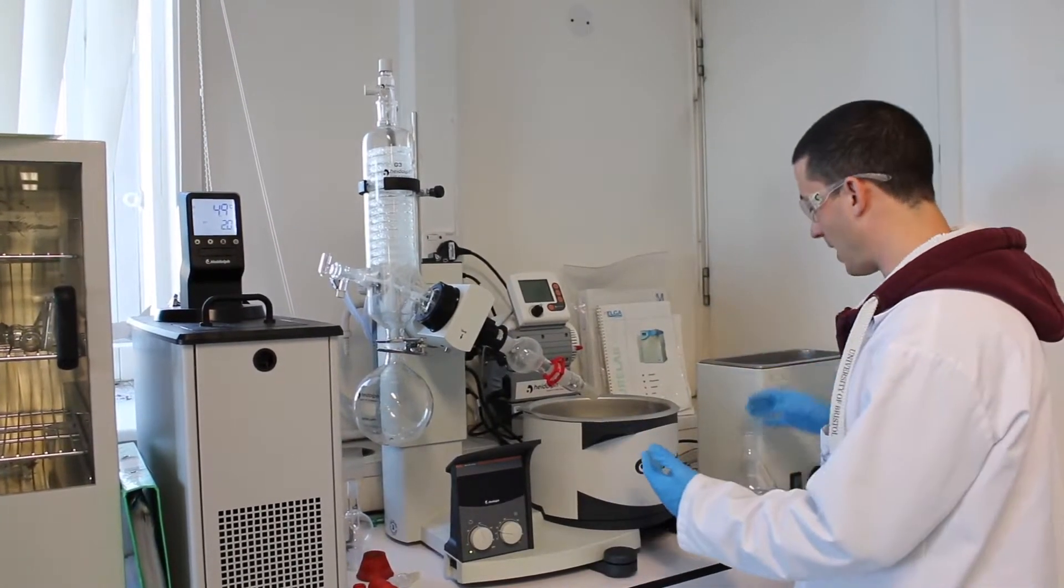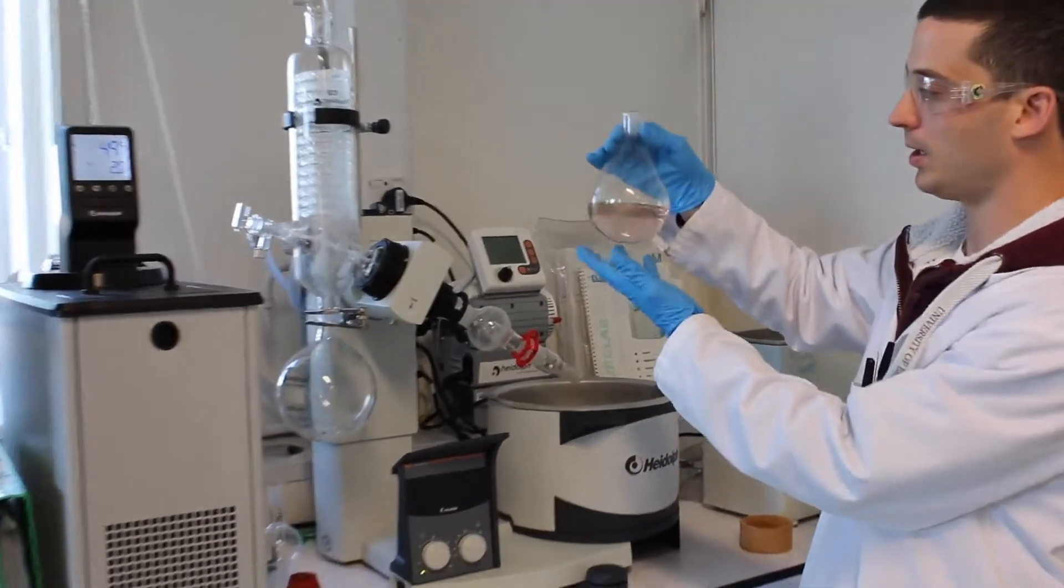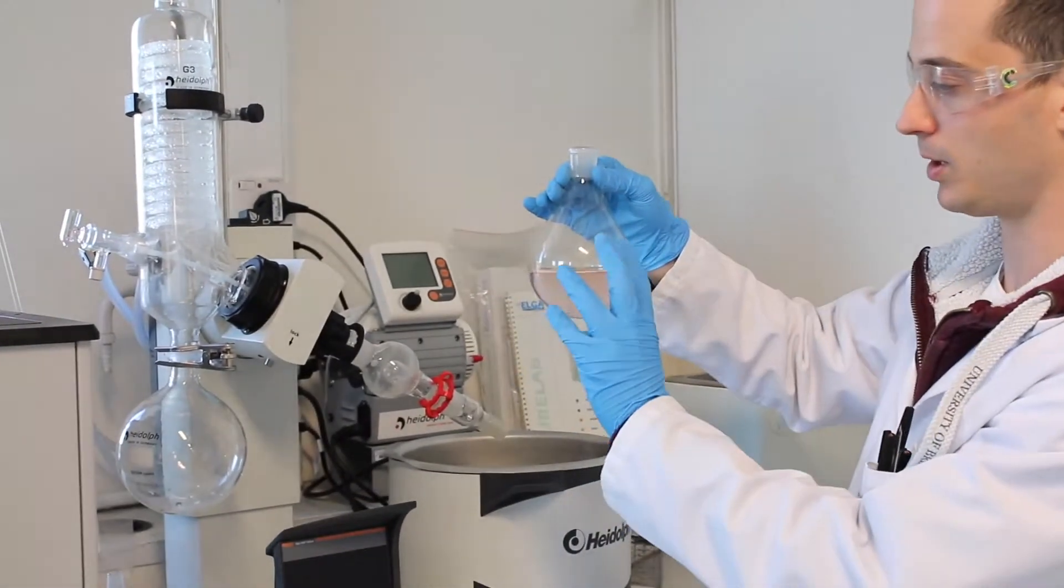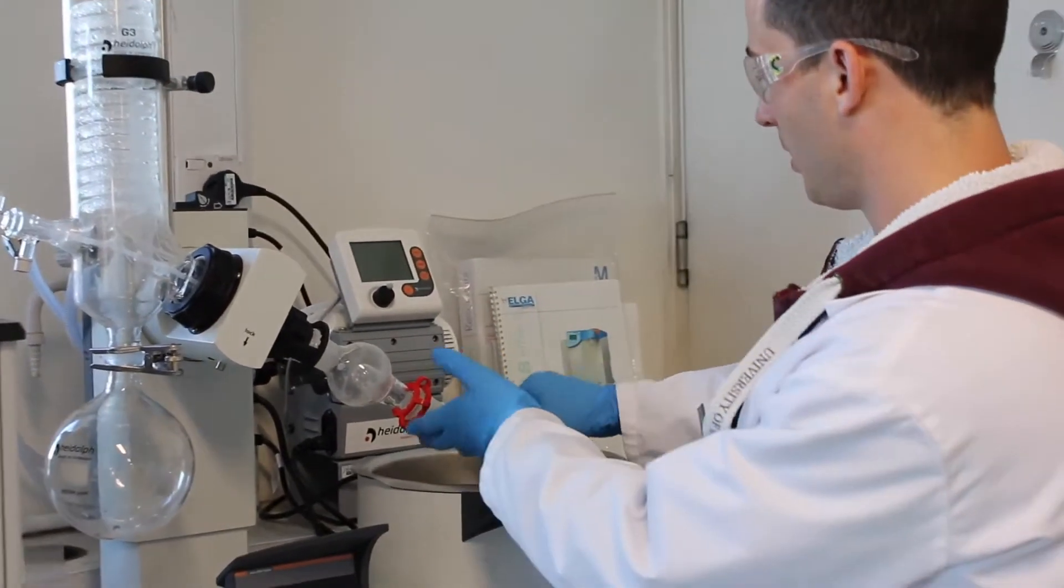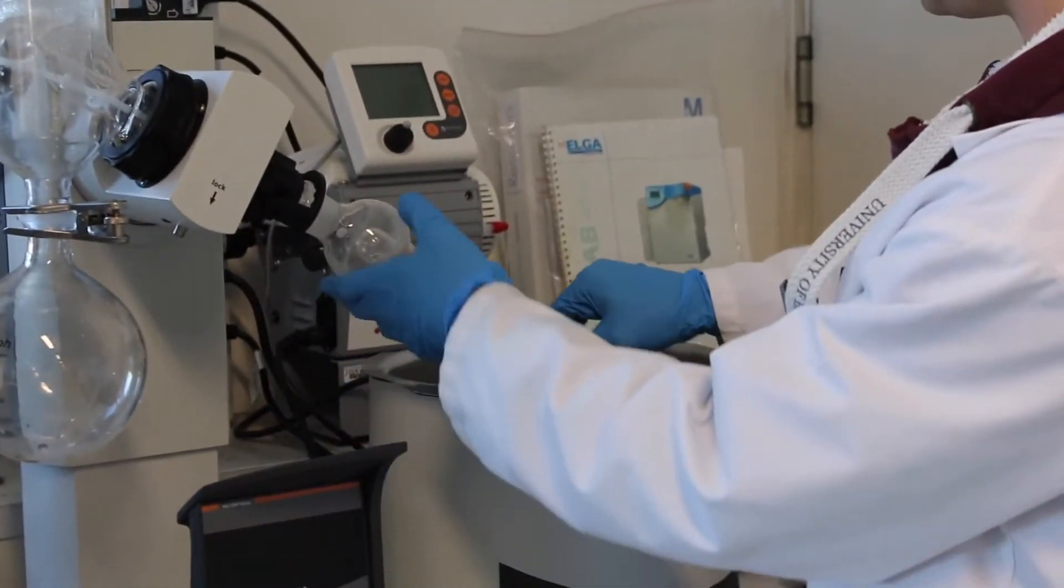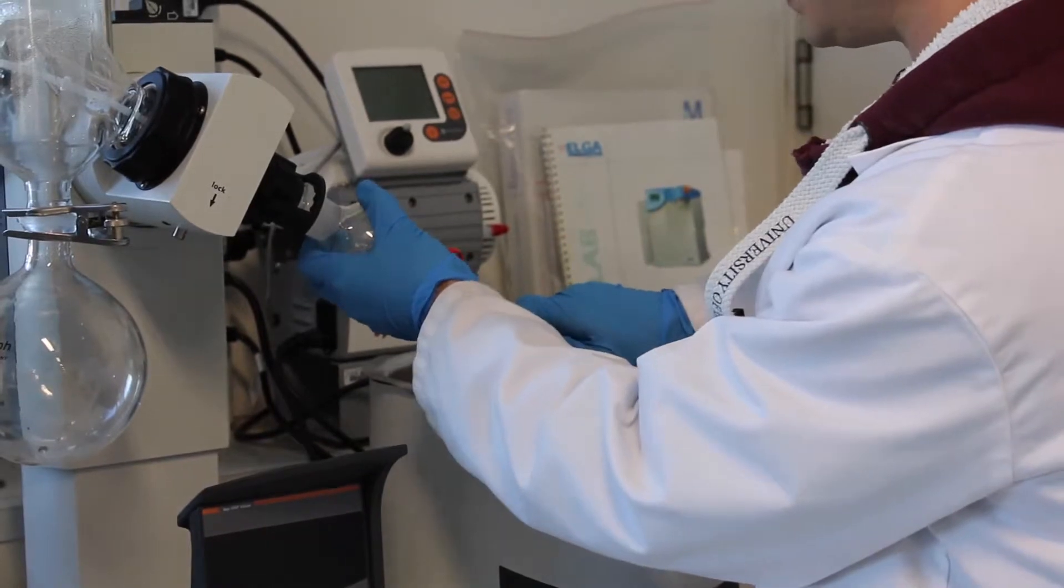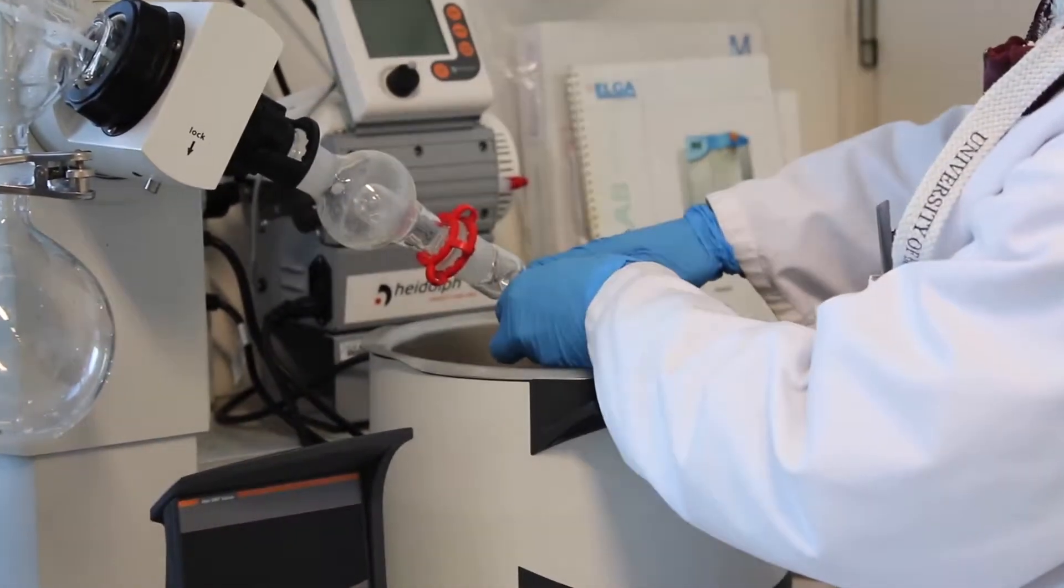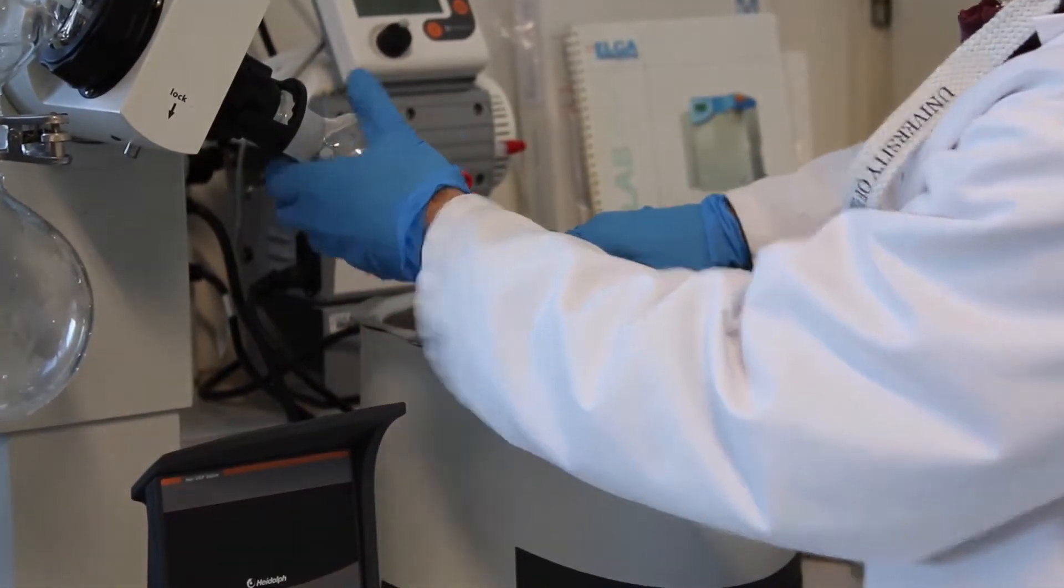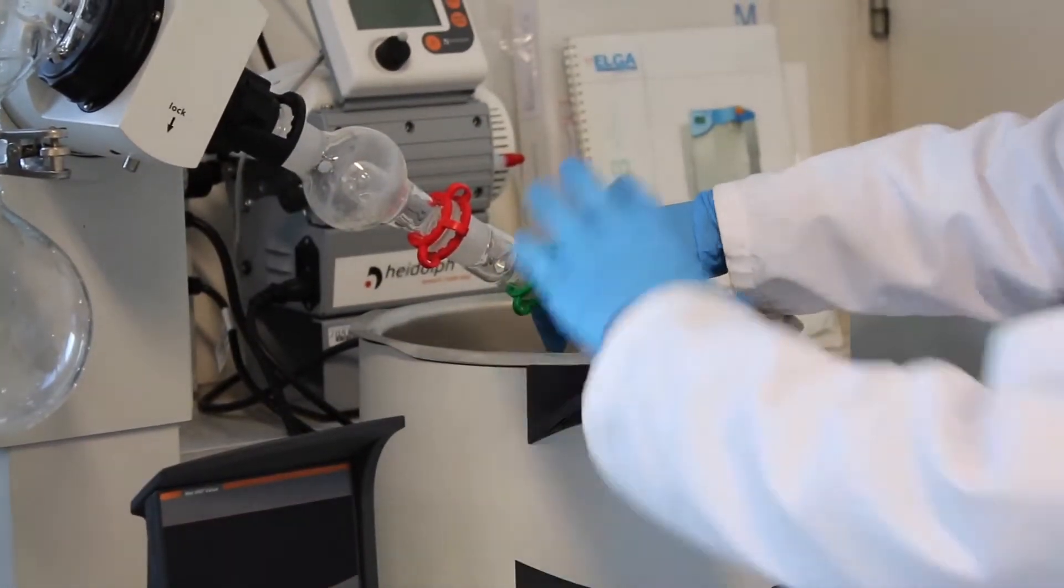In this case, now I'm going to attach our flask. So this contains water and we want to rotavap it off. So here we have our glass connector. You want to attach it here. Make sure it's nice and attached and use the clamps for safely holding it there.